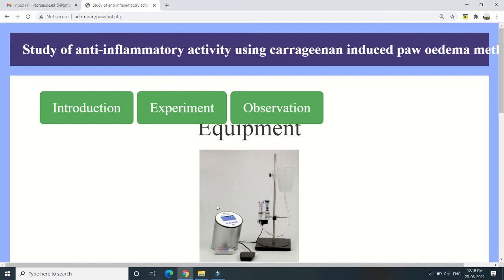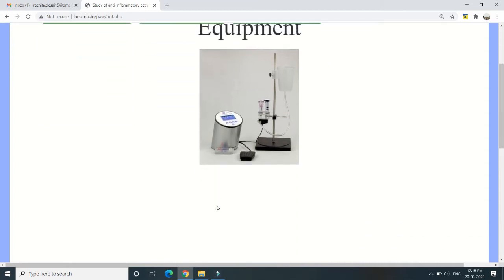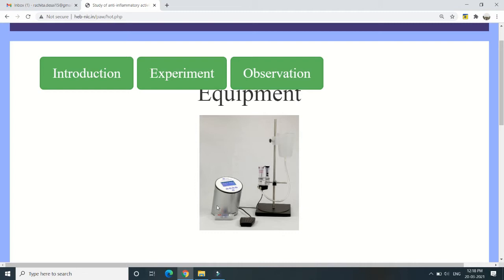After giving the drug, we will inject carrageenan via the sub-plantar route — that is, into the plantar surface of the hind paw of the rat. Two hind paws are available for each rat. One hind paw serves as control, where no carrageenan is injected. In the other hind paw, we inject 0.1 ml of carrageenan using the sub-plantar route of injection. The leg not receiving carrageenan serves as a reference control.